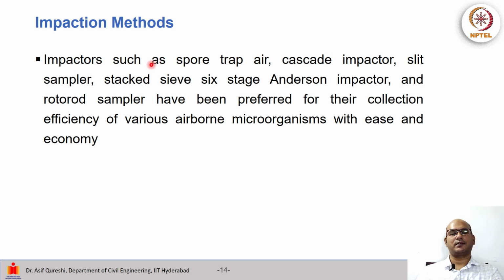There are several impactors such as spore trap air impactor, cascade impactor, slit sampler, stacked sieve 6-stage Andersen impactor, and rotorod sampler. These several samplers that are mentioned have been used quite substantially and are sometimes preferred because of their collection efficiency of various airborne microorganisms.